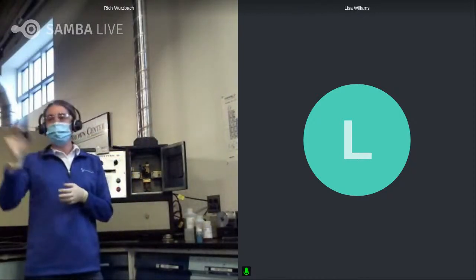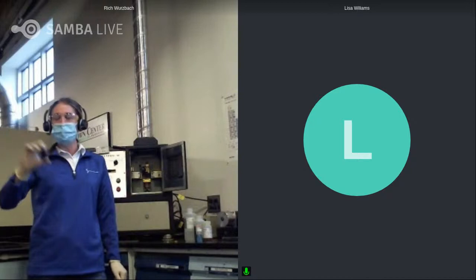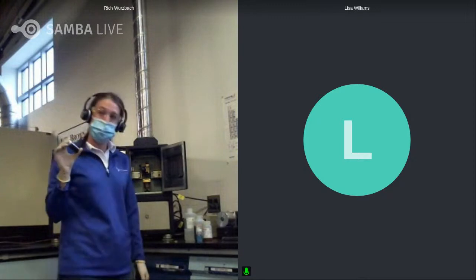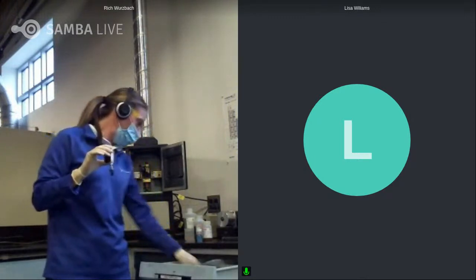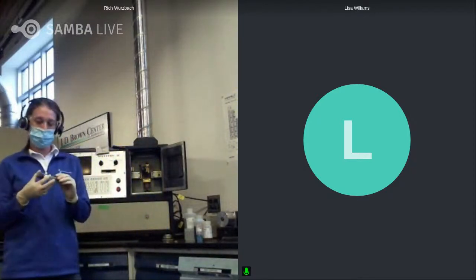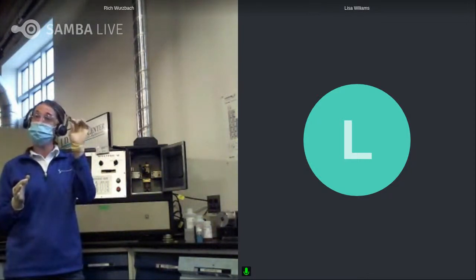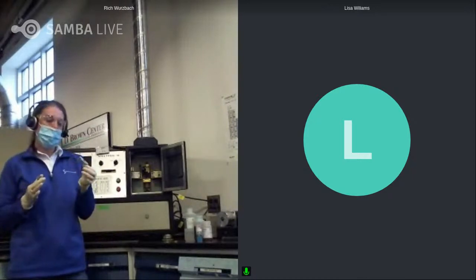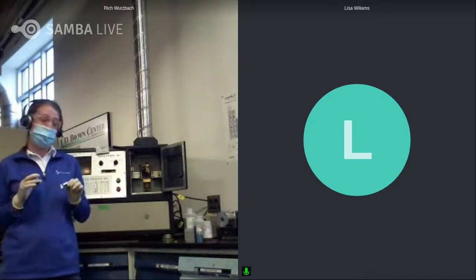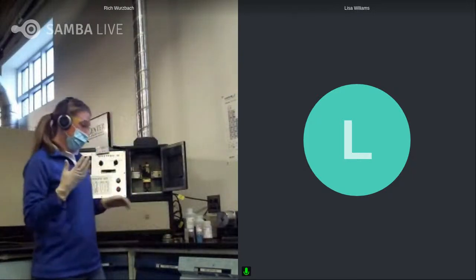Once your grease sample is dissolved, obviously this is going to be a little bit more volatile than your oil sample, unless your oil sample is really contaminated with something. So what we're going to do is use the shield, and it's called a fuel shield. This will be in the instructions that I provided that you can get at the end of this. Spectro Scientific sells this. These are reusable. They're made out of aluminum, and you can simply wipe these off with alcohol wipes, or any kind of mineral spirit is fine. So they're reusable, and everything else is going to be a consumable.